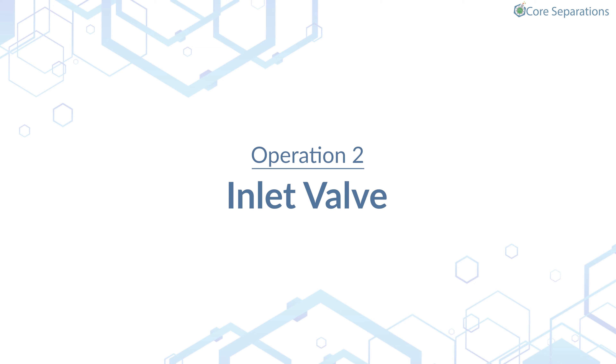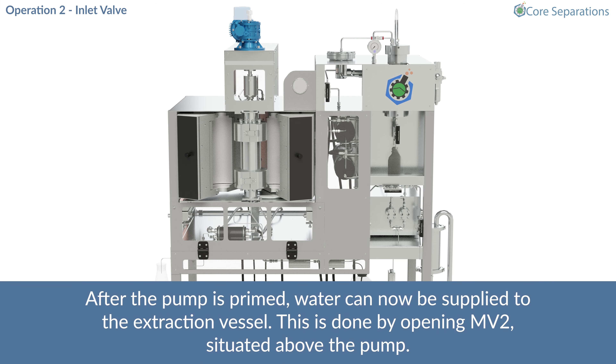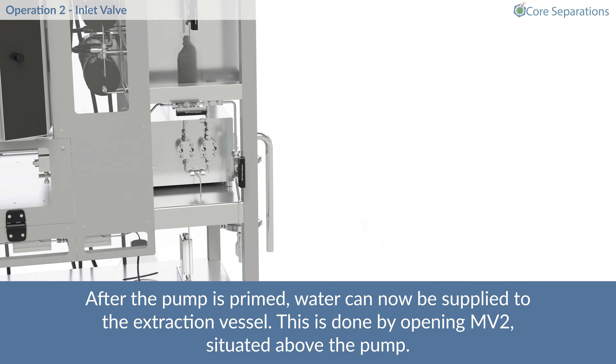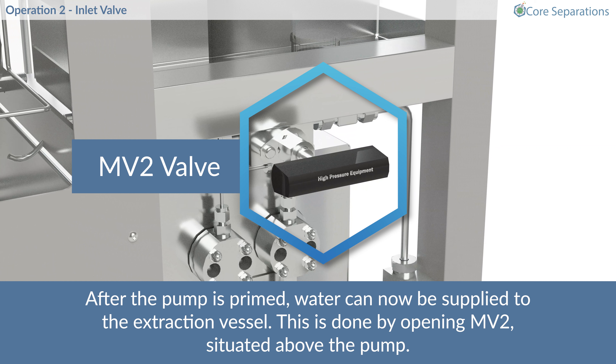Operation 2 – Inlet Valve. After the pump is primed, water can now be supplied to the extraction vessel. This is done by opening MV2, situated above the pump.